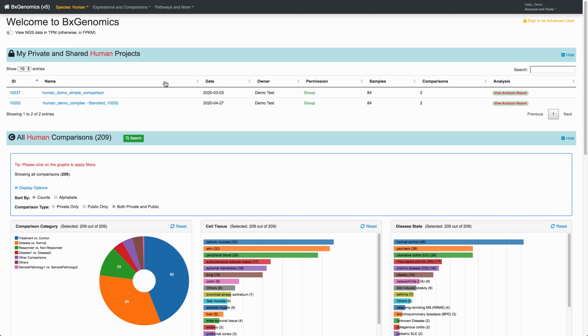The system is set to share the projects within the group. If a group has multiple accounts, then the projects will be displayed here for all the accounts in the group.